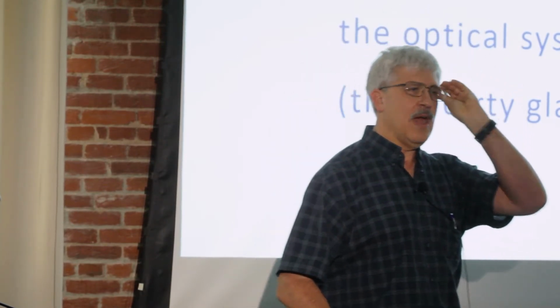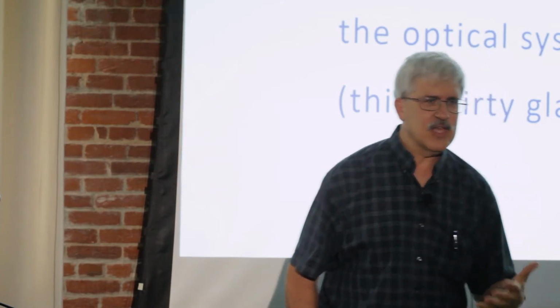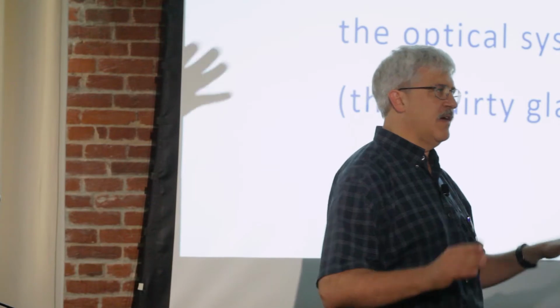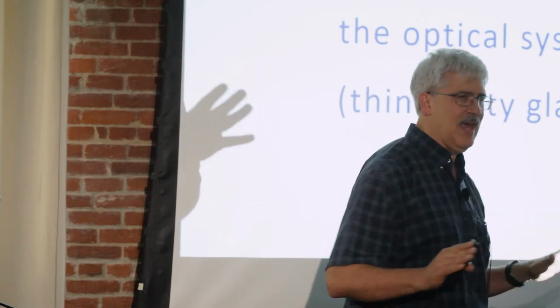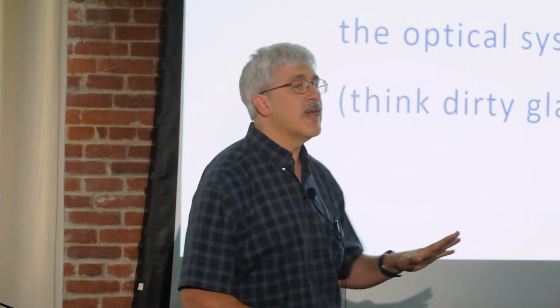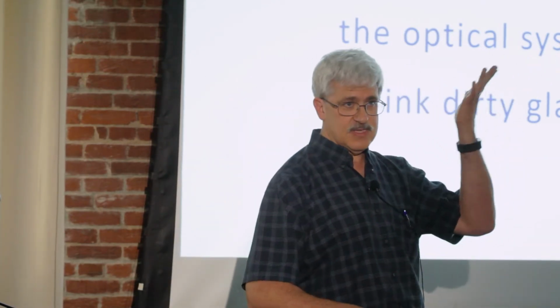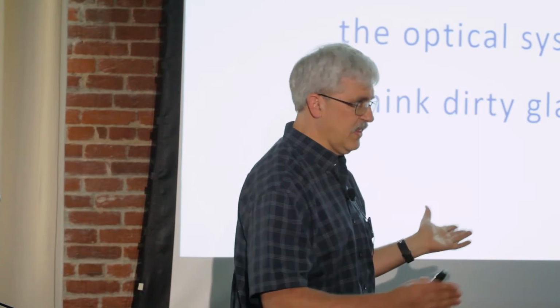Your eyes accommodate. They get used to what you're looking at. They get used to the garbage. But the camera never does. The camera's going to show you everything. So you want to make sure everything is clean: the top of the slide, the bottom of the slide, the objectives, the condenser, the field, everything.